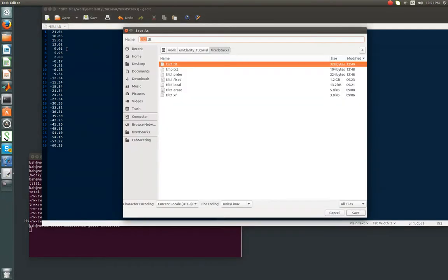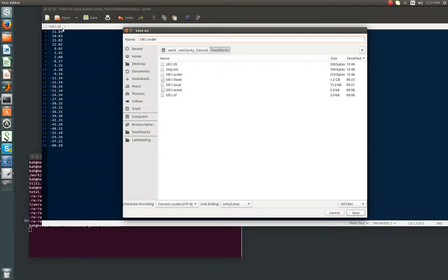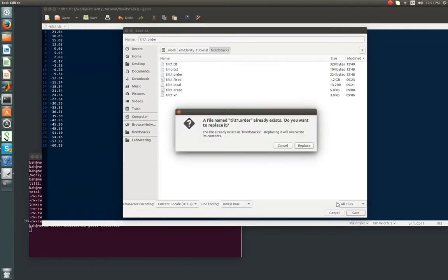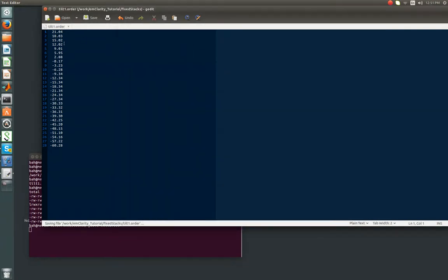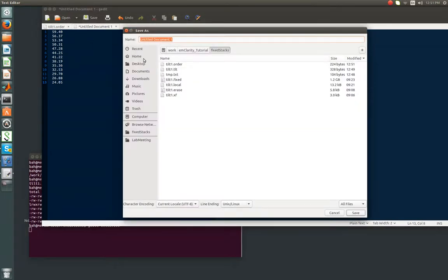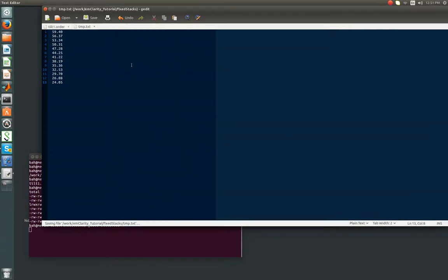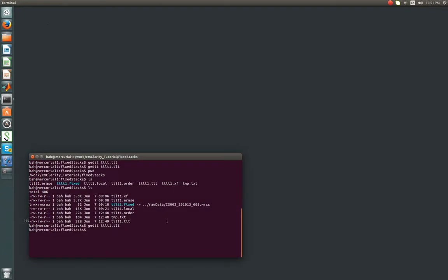And we want to save this as tilt1.order. Make sure you don't accidentally overwrite your tilt file that has your tilt angles in it. Now we're going to save, make a new file, in this case I'm going to hit ctrl-n, and paste the values we cut out. And we can't use that directly, but what we can do, we're just going to save it as temp.txt, and we're good to go. So I'm going to close both these.